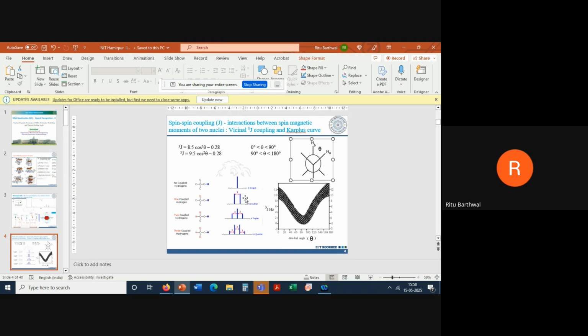When you take a spectrum on NMR, steady state, you will see two lines. If this H was not present, this would be its position. It will be split around that as the center. This splitting is because of 1H and 2H. We call these spins in our terminology. So this is a spin and this is a spin, and we call this spin-spin splitting. The first effect I told you about was not splitting, that was shifting, the chemical shift, because of the hydrogen's own electrons. That was this blue hydrogen atom, whose own electrons were shifting it.